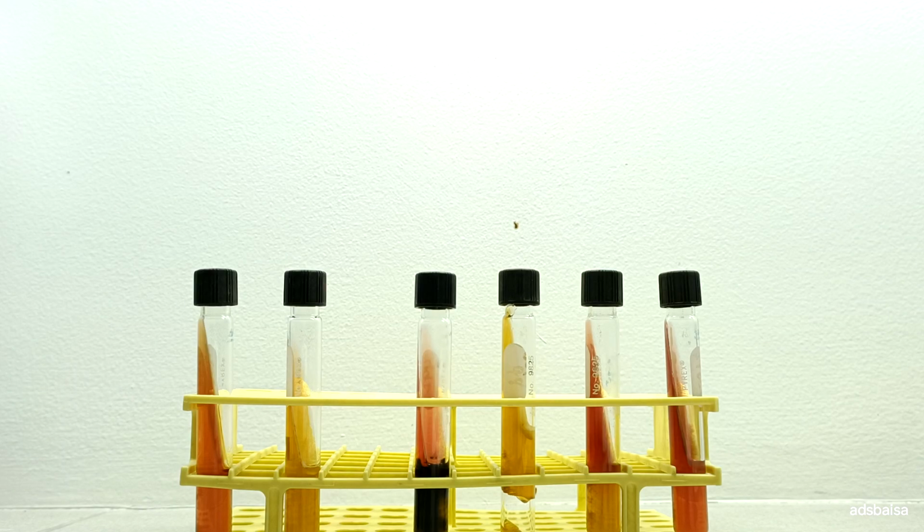Hi guys, so this video is all about the triple sugar iron agar test, or what we call TSI. The triple sugar iron agar test is one of the biochemical tests used to differentiate and identify gram-negative bacilli. So the triple sugar iron agar test is used for the identification of enteric bacteria or Enterobacteriaceae.